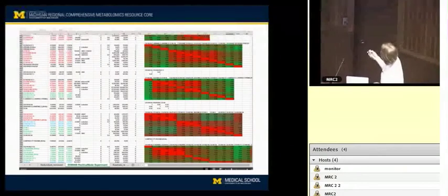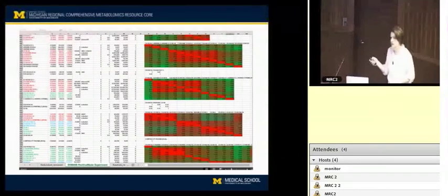You can't really see that here, because this first column is the bin, and all of these things came out continuously at the beginning of the chromatogram, but that's okay, because once we've decided that things are in a certain bin, we also then start to cluster them. Before we bin and cluster them, we take the correlations of all the metabolites against each other over all the samples in the study.